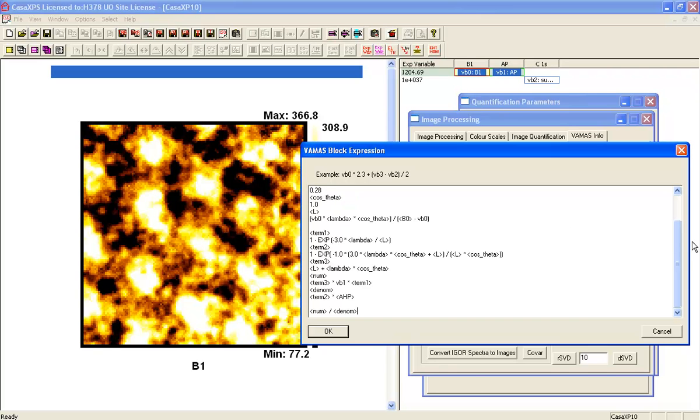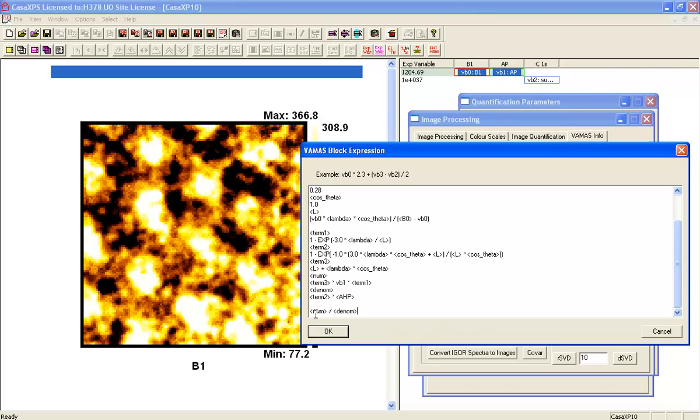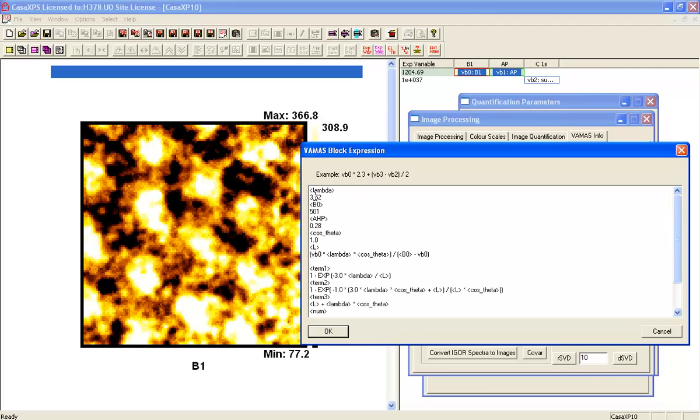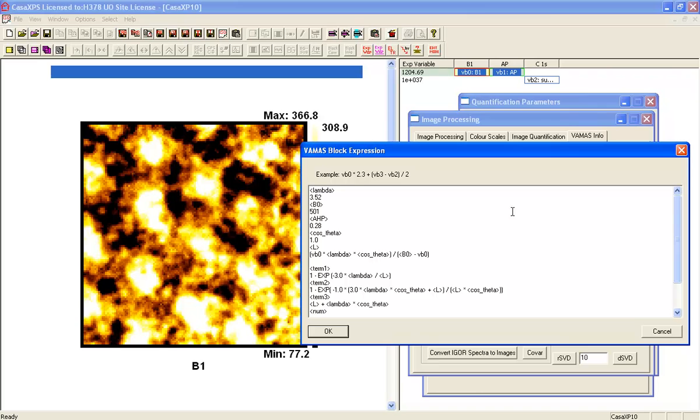You have definitions just like in the custom report that represent these less than, greater than strings, but they appear as you would see in the custom report, but when it comes to actually defining a calculation, it's just a single line. There's no need to put in a name anymore. It's just the formula that appears. So throughout this file I've got sets of pairs of definitions and values, and then ultimately I combine them all in this term here to give me a formula that will be quite complex when it's seen in the final result, but the principle that was used in the custom report is also applied here, that you simplify the calculation in terms of its definition by using these types of strings.